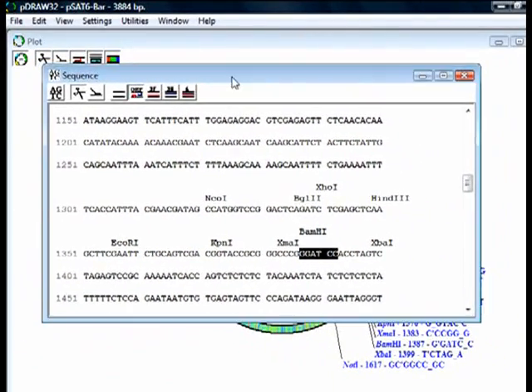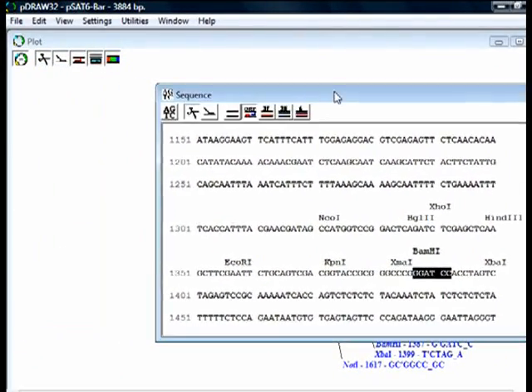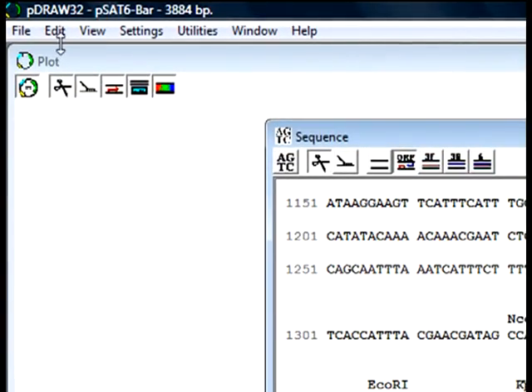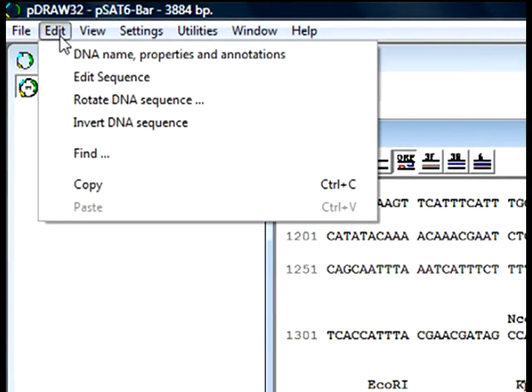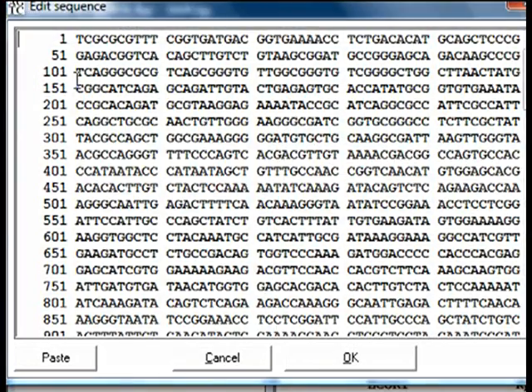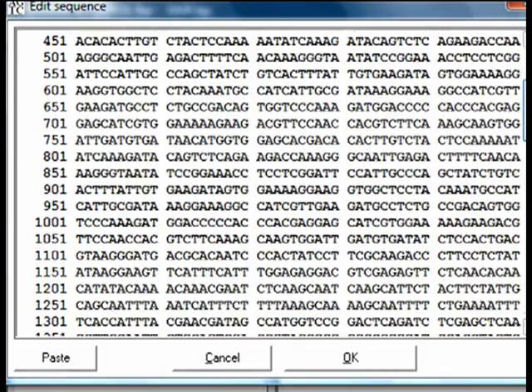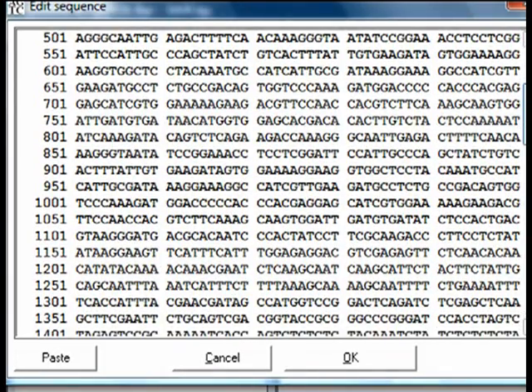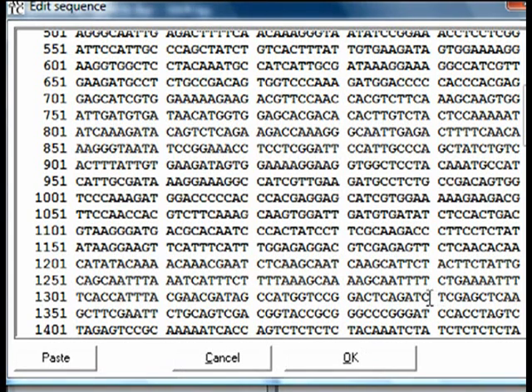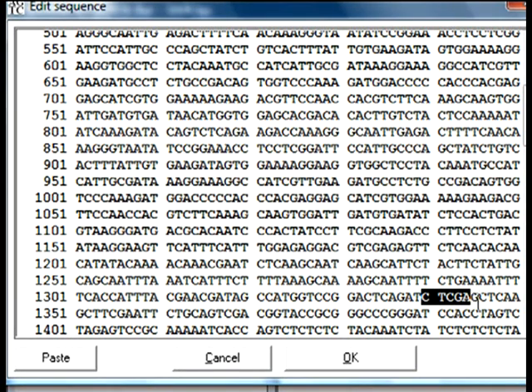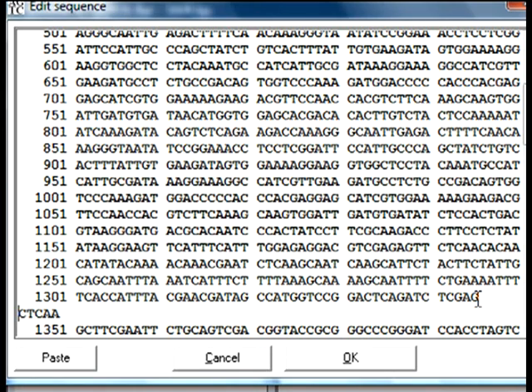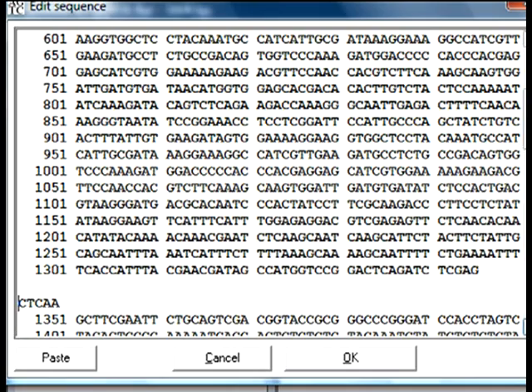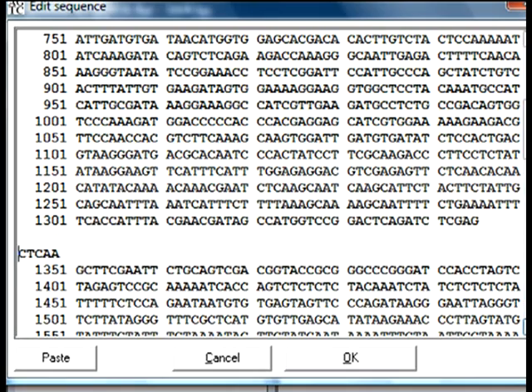Now I open an edit sequence window, locate XhoI site on line 1301 and introduce a line break after it. Then I go to the line 1351, locate the BamHI site and introduce a line break before.